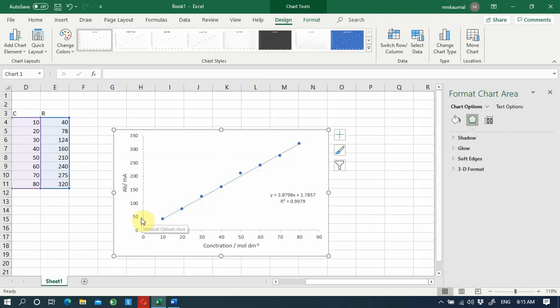Now tick marks are outside. Again, some people like to have tick marks outside, some people like to have tick marks inside, but keeping tick marks outside is the right way to do it. So you can draw the graph the way we discussed. So remember, tick marks outside. This equation is here. Never draw beyond the upper and lower points.